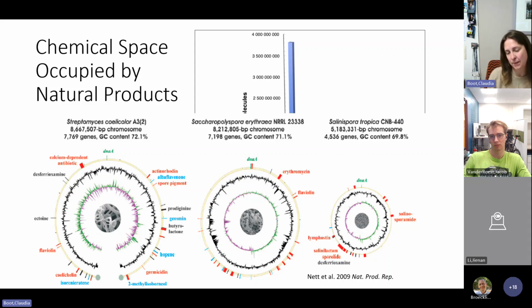I lean towards thinking about natural products and unknown analysis because that's my background, particularly for microbes. Even for these different species of actinobacteria, people have studied how many different types of natural products there are. A lot of our antibiotics come from these molecules, and are we likely to find new antibiotics from these organisms? Estimates are, depending on their genome size and the number of analytes we've already identified from them, that 70 to 90% of their chemistry is yet to be discovered. So there are a lot of unknown unknowns out there.